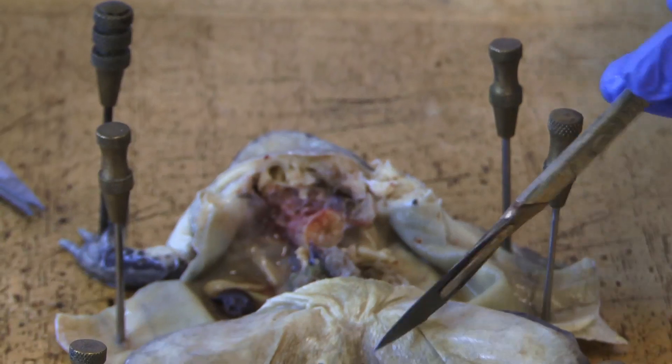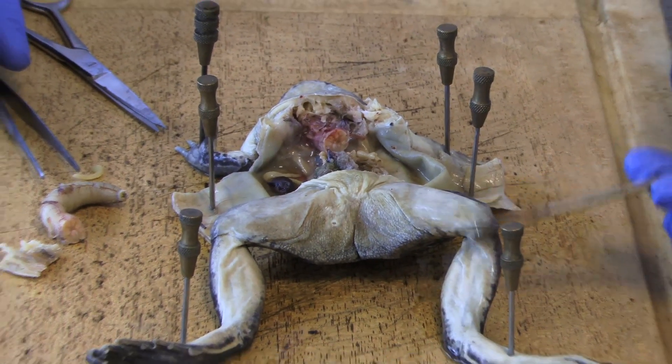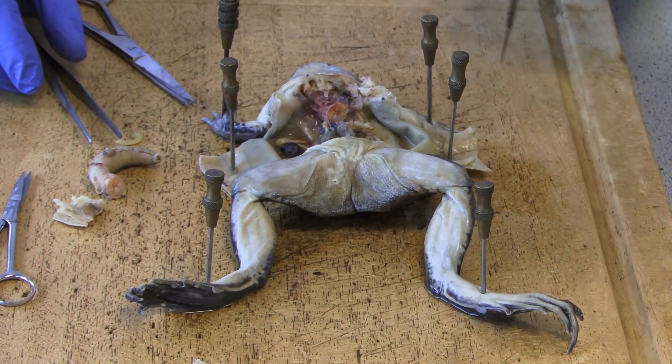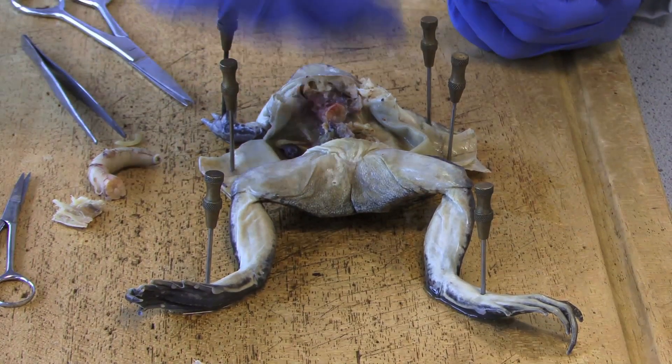What I want to do now is just have a look at one side of the leg, so we can have a look at the thigh and the remaining leg, so we can expose the muscles and then that will be the basic kind of anatomy of the frog.